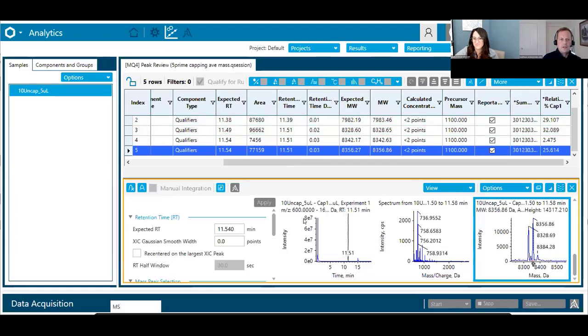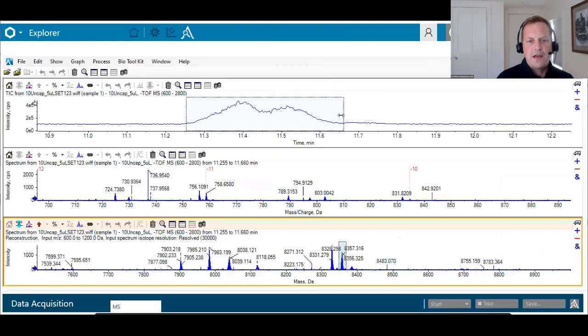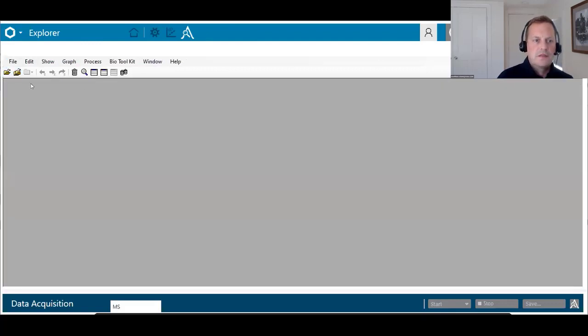Cool. All right. Why don't we put a pin in questions for now and we move on to LNP impurities? All right, so here's my component screen from the 5' capping assay. I'm going to go to Explorer again, and this data was collected on our 7600 instrument using electron fragmentation. So I'm going to close these, and I'm going to open up data that was done with an ionizable lipid called MC3.